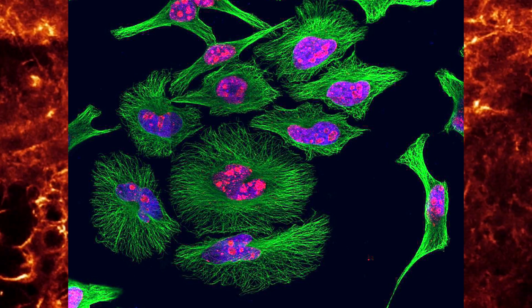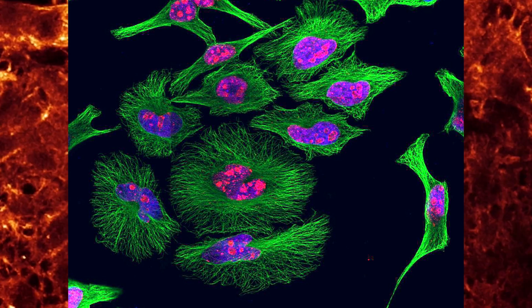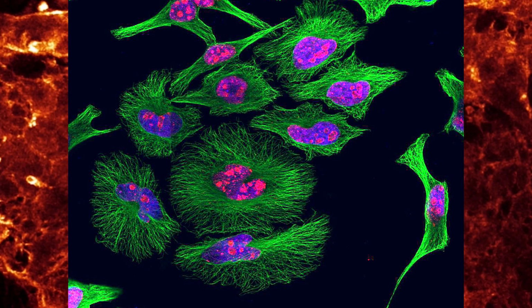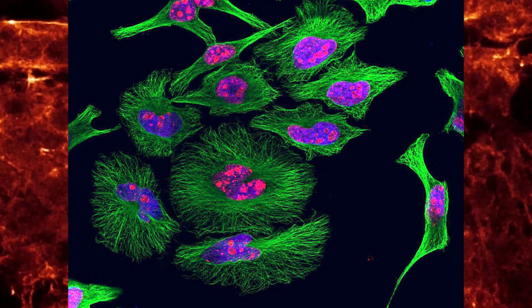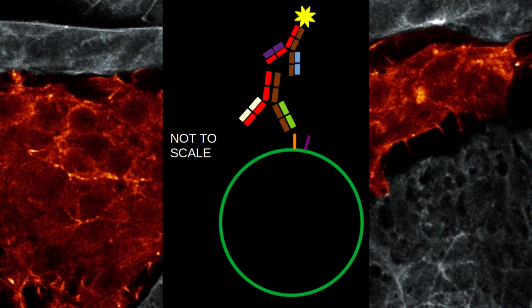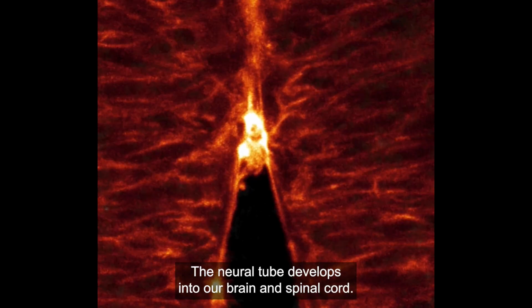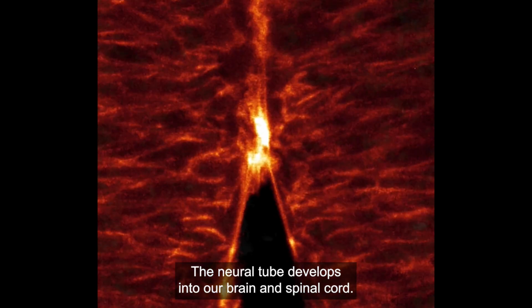So for example, anti-actin followed by an anti-mouse, because mouse is where you got your first antibody from. This means you can ensure specificity to your targeted site and thing of interest. This is because not only do you have to have the primary antibody bind to it, but the secondary antibody has to bind to that first antibody and often to a secondary thing of interest. This ensures that you only get, let's say, a result if both things occur.